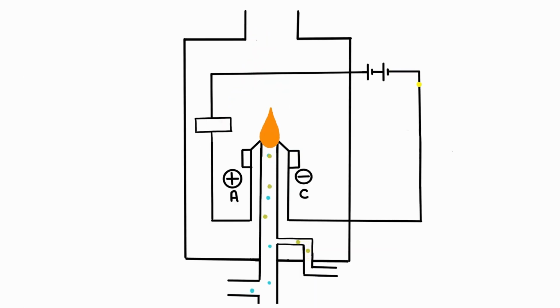Now, the current that is pushed out from the negative battery terminal follows the same path, reaches the flame, but instead of the current flow getting terminated abruptly, the current uses the ion bridge formed due to analyte combustion. This helps the current pass through the flame, emerge from the other side of the flame, and enter the electrometer where it can be measured. And the reading on this electrometer is reflected on the chromatogram, which is how we know we have an analyte that is entering the detector.